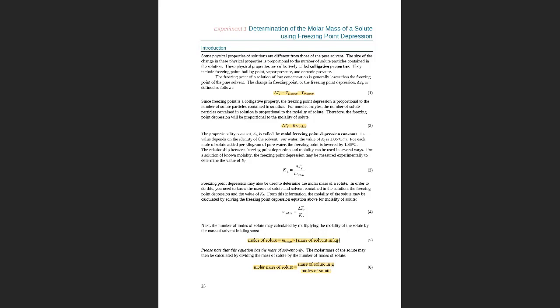Also, I will show you step by step how to plot the data in Excel and display the equation on the chart. And you will need the intersection of the two equations to calculate the freezing point. So I will share the application and show you how to do it.